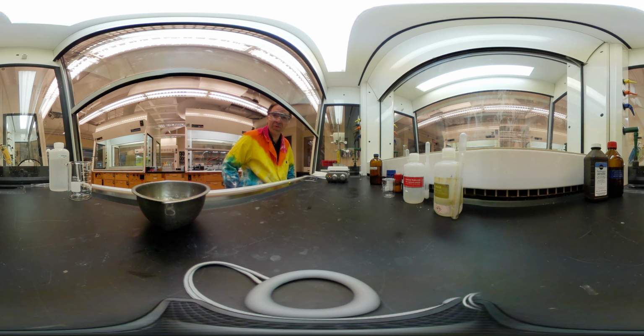All right, we are at 5 minutes, so it's time to stop this. I'm going to go ahead and take the heat off. Likewise, I'm actually going to also lift this up so it cools down a little faster. I want to drop the temperature below about 100 degrees Celsius, and then let it cool just a moment, and then we're going to add glacial acetic acid to this.